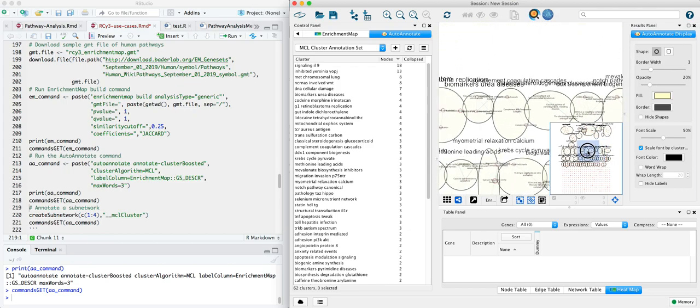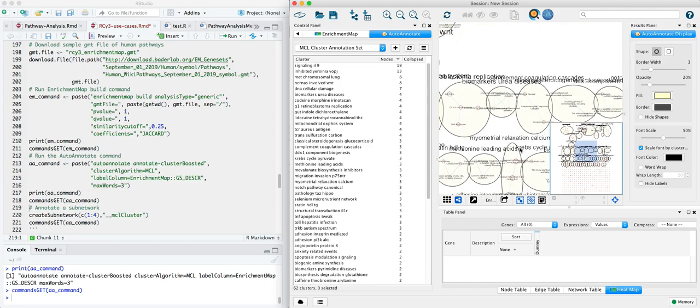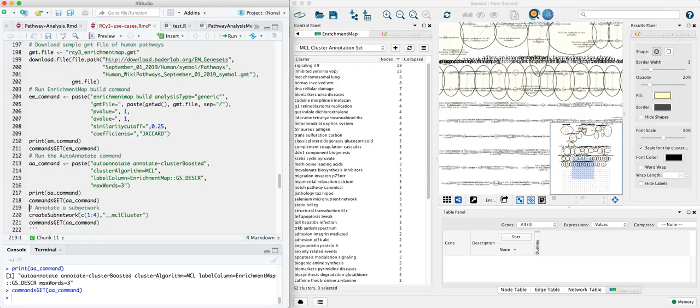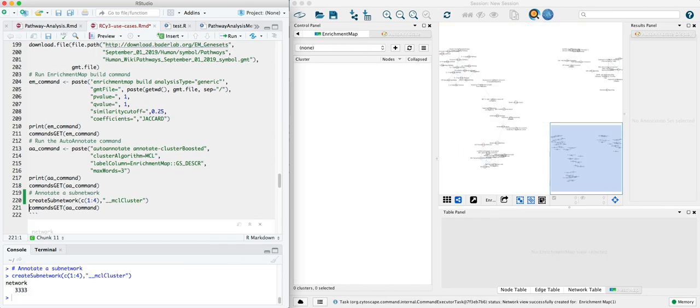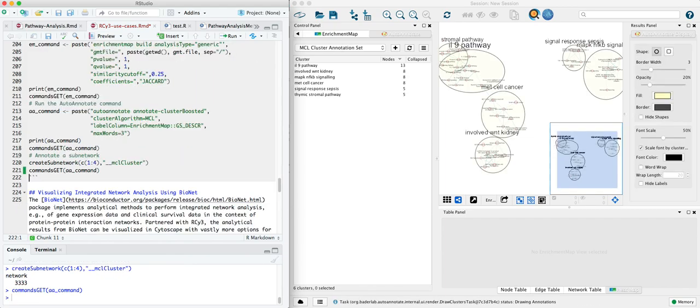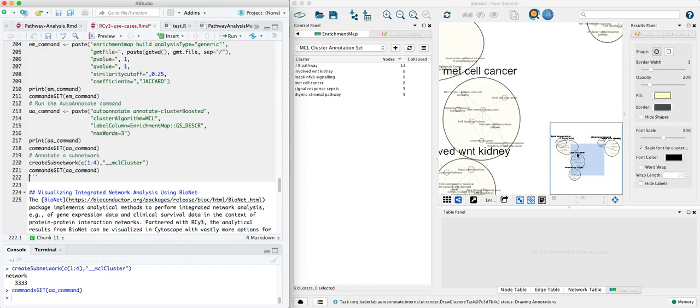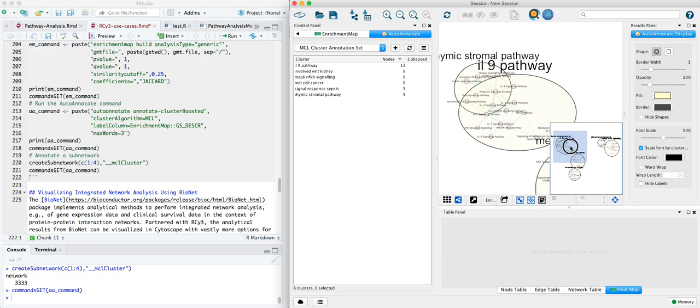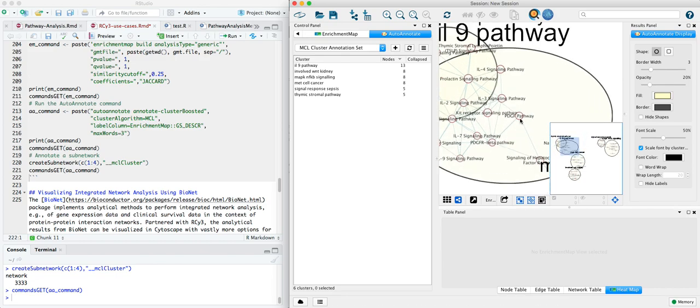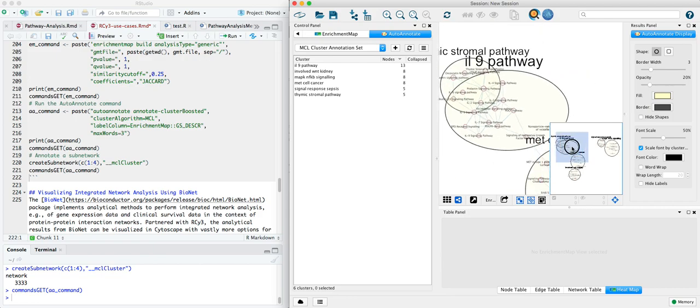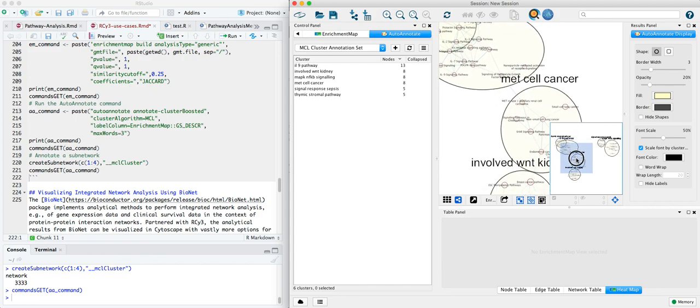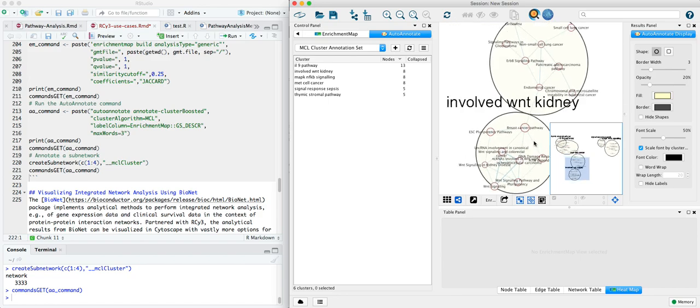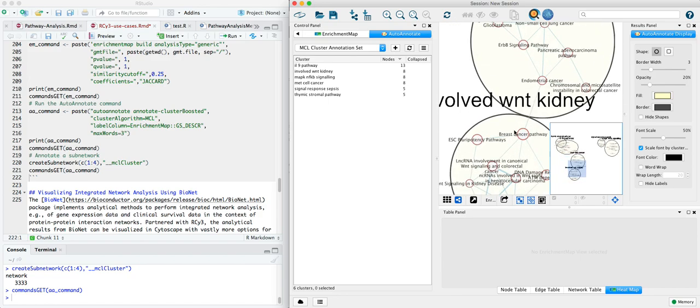It's a lot to look at here because it's all of WikiPathways. And so let's go ahead and just take a subset, a subnetwork of the first four clusters, and repeat that annotation step. Now we can see in a bit more detail the actual pathways that are part of each of these clusters and the word cloud-based titles that they're being annotated with.